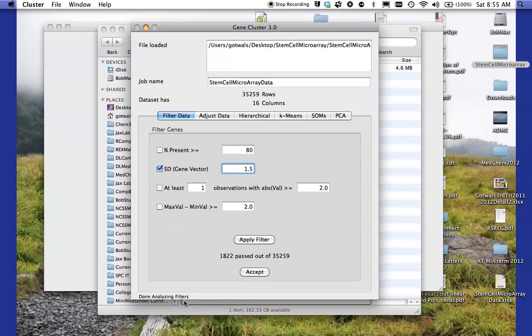At the bottom there, you notice it says done analyzing filters. So I'm going to accept that and we're done with that screen.